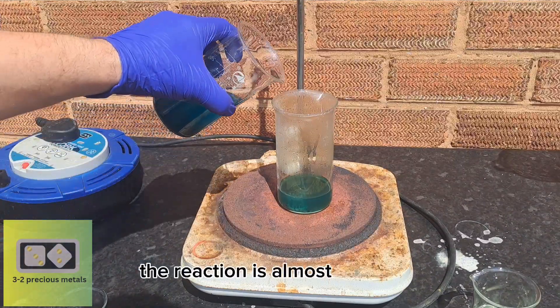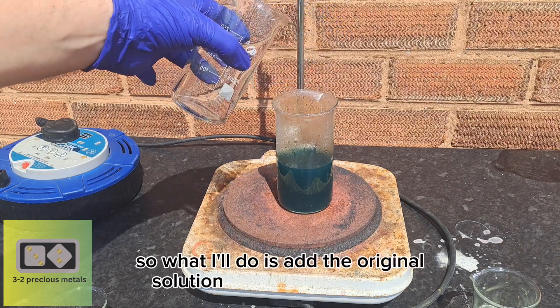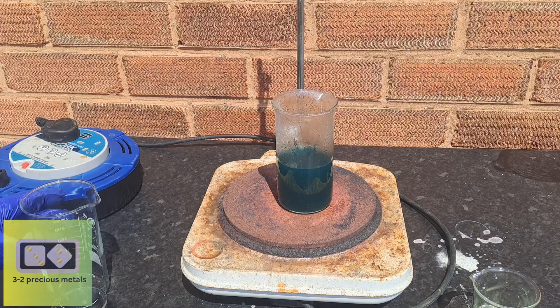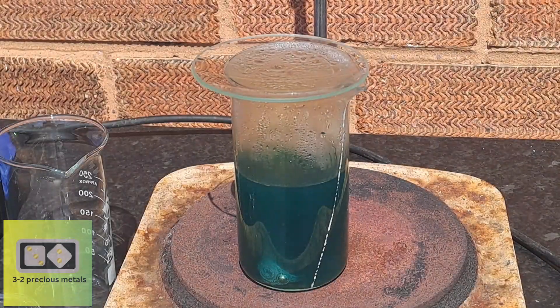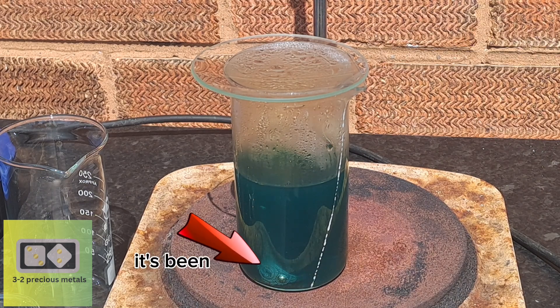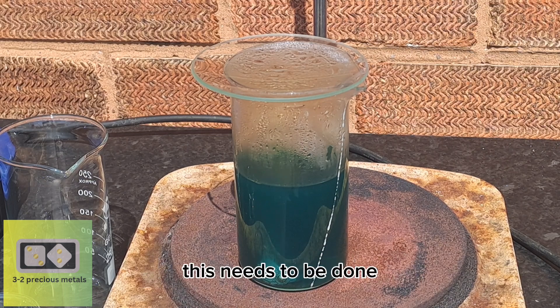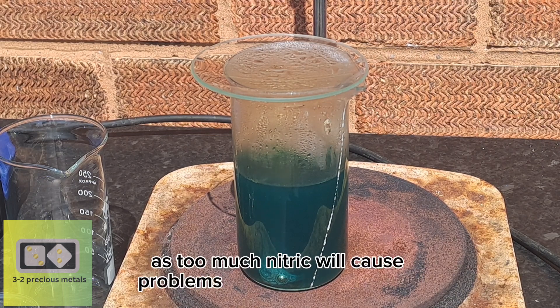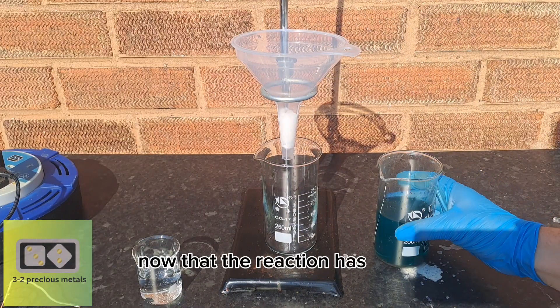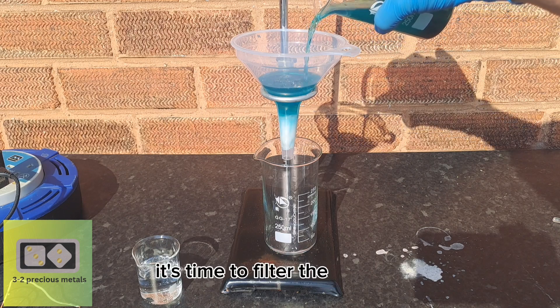The reaction is almost complete — there is just one small piece left — so I'll add the original solution back into the beaker to use up any free nitric. Remember that ring I left out at the start? It's been placed into the solution to use up any excess nitric acid. This needs to be done as too much nitric will cause problems with the next reaction. Now that the reaction is complete and all excess nitric acid has been removed, it's time to filter the solution.